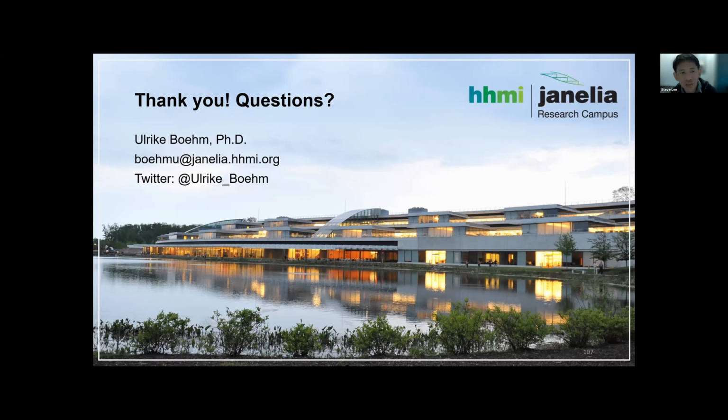The first question is about 3D localization. One question from Chen would be about the axial imaging range. What sort of axial imaging range would 3D localization cover? And secondly, my question is, wouldn't shaping the 3D PSF also reduce the lateral resolution, because you're exciting a lot of fluorophores at the same time with a broader PSF?